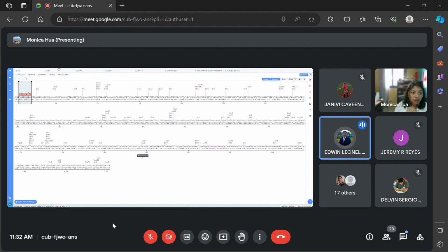Yeah, because you're adding this before the actual PCR. Before you do PCR, you need to know what your primers are, because PCR requires primers. So before you do any kind of PCR, you need to plan first. This is what we usually do before any experiment. We need to plan our experiment. So first you need to design your primer.